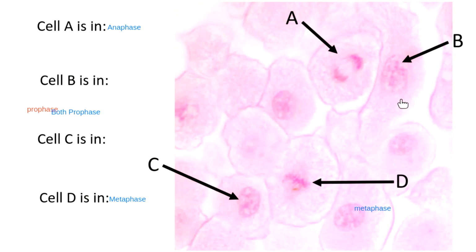Both of them are cells that are in prophase, but this one we would probably say is late prophase. And for that, if you sneak a peek over here, see this genetic information right here, and there's no envelope around that at all. So that's definitely late prophase. So these two are probably late prophase. This would probably be an early prophase right here, because I can see the chromosomes, but still that envelope. Same deal with this one right here. See how you can still see that envelope around it.